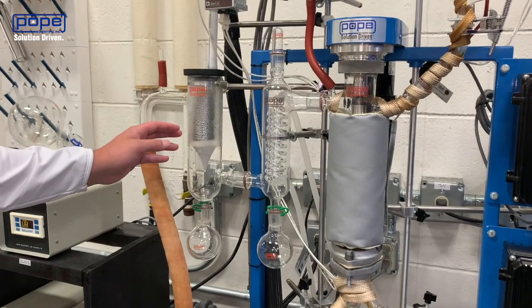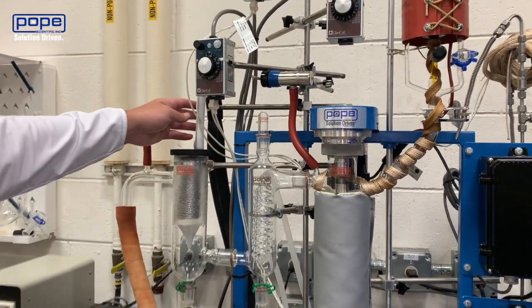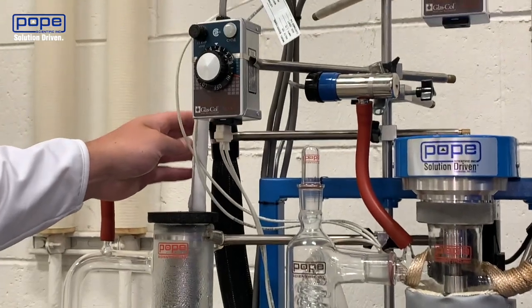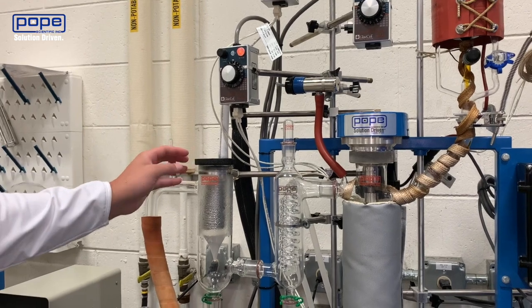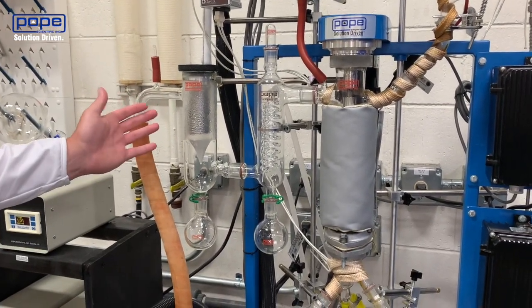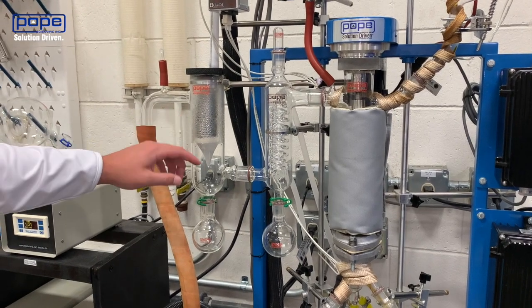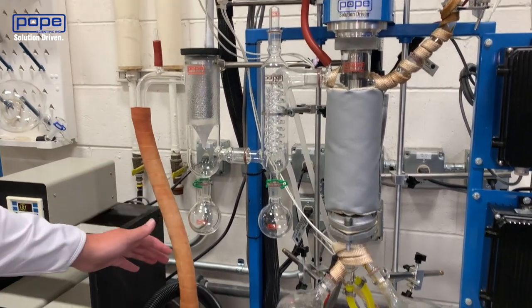Next to that is the cold trap. The cold trap is cooled by an immersion probe chiller that we have provided by PolyScience. This cold trap is kind of what you want to call your last line of defense. Essentially, you're going to be condensing down whatever solvent — most likely ethanol — that's in your material. This prevents it from getting down into your vacuum hose and into your vacuum pump itself.